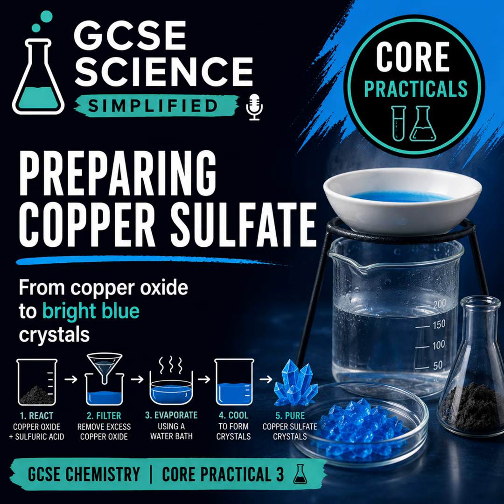What starts with a black powder and ends with bright blue crystals? Same copper, completely different form. Today's practical is about turning a messy reaction into a pure, solid product and understanding why every step matters. This is Chemistry Core Practical 3, Preparing copper sulfate.